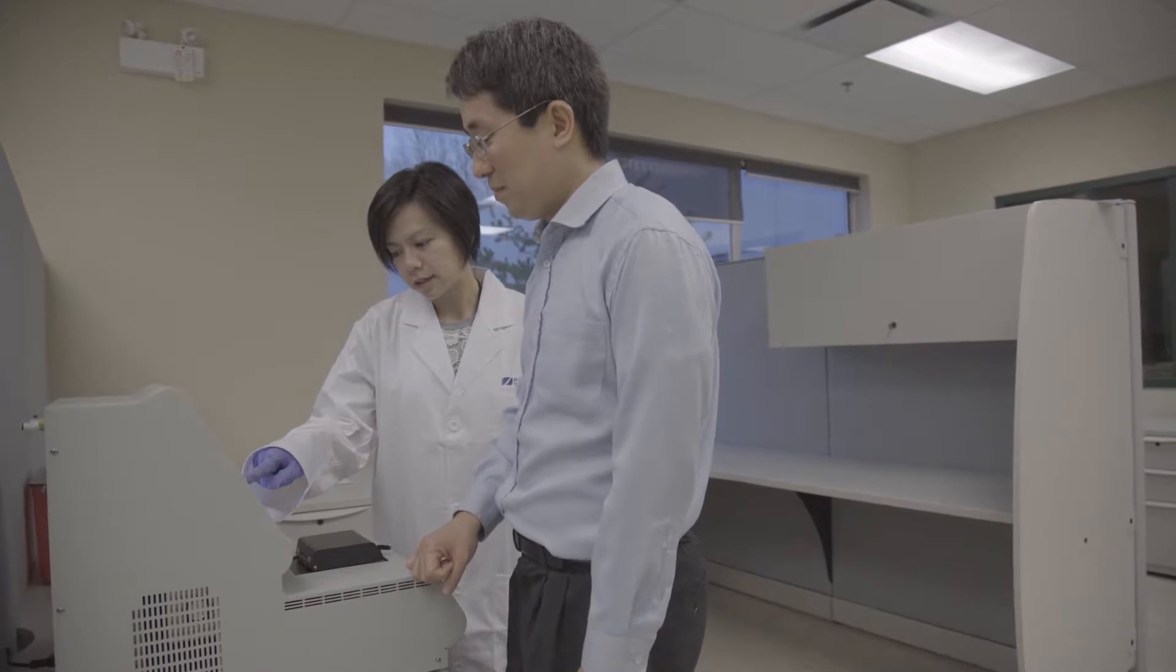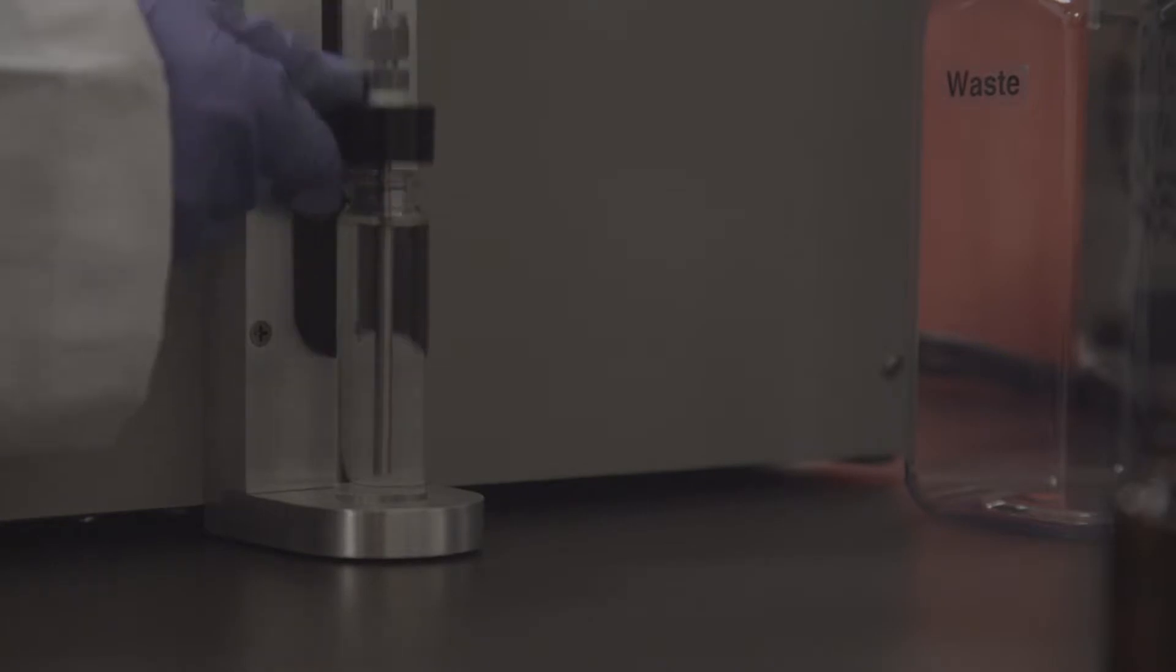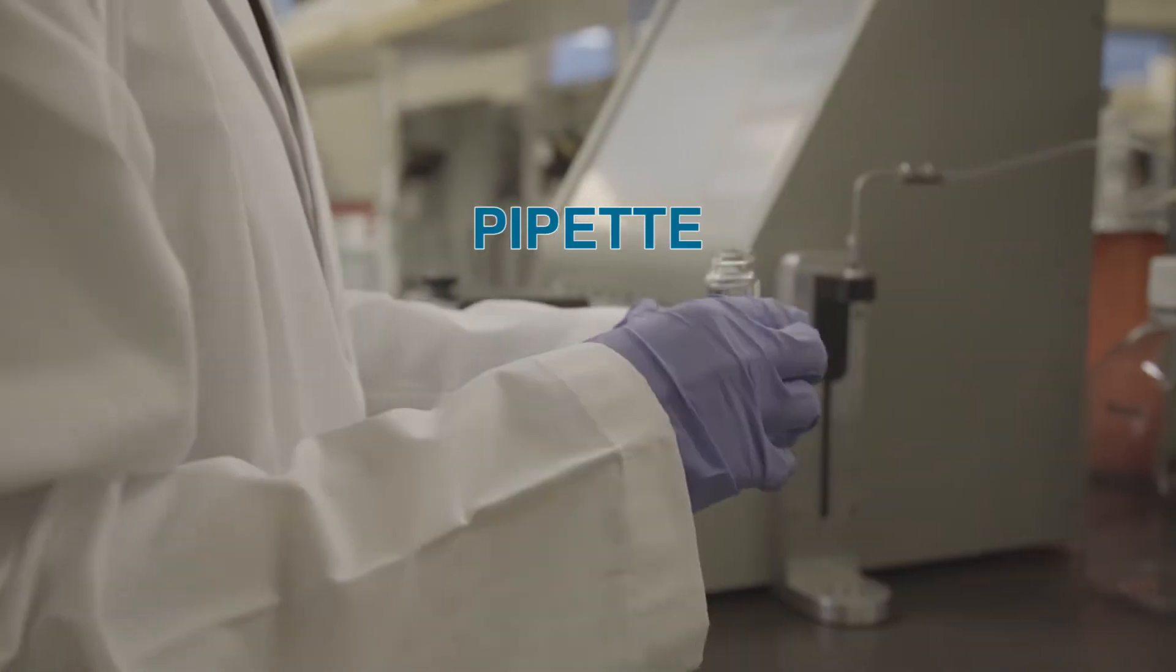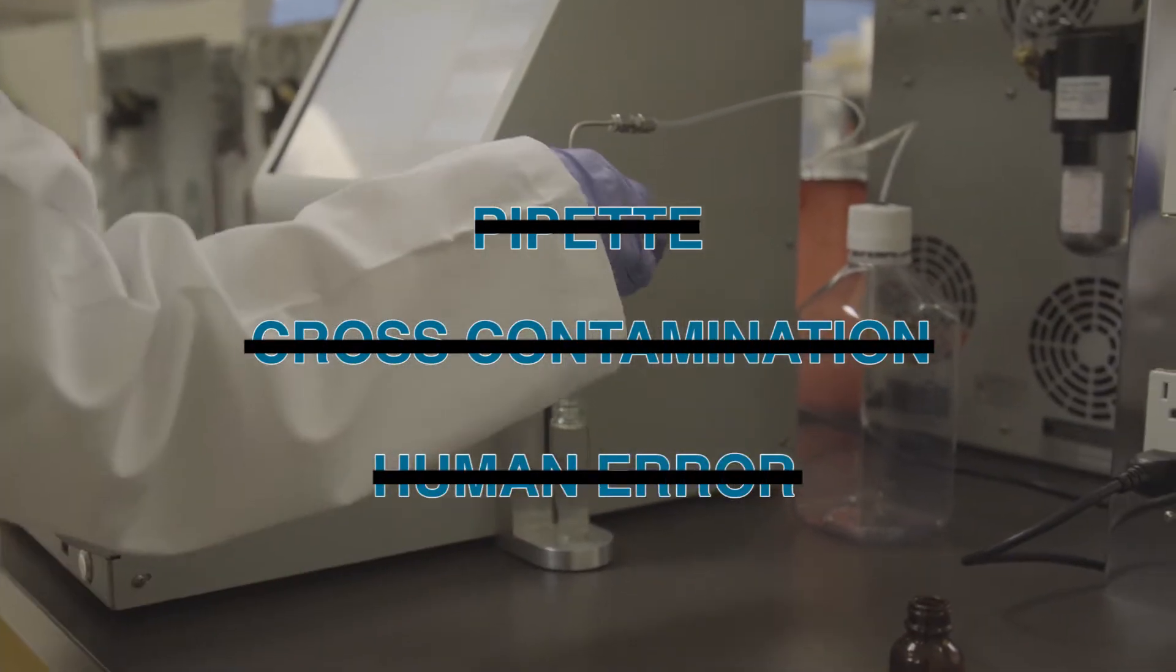The JFA 70XI features an automatic sample input using a new vial injection system that loads the sample automatically. The sample input always uses the exact amount of sample required by the ASTM method. No more pipette. No more cross-contamination. No more human errors.